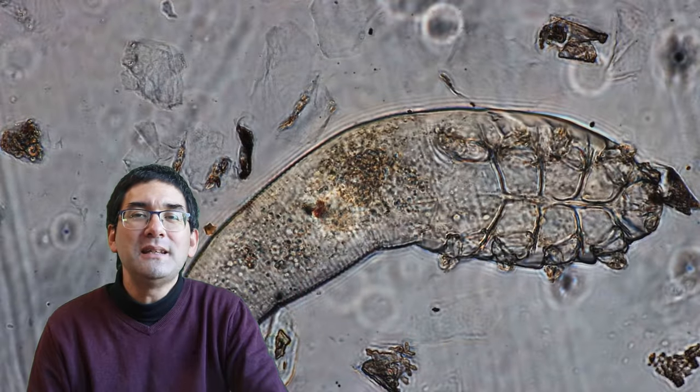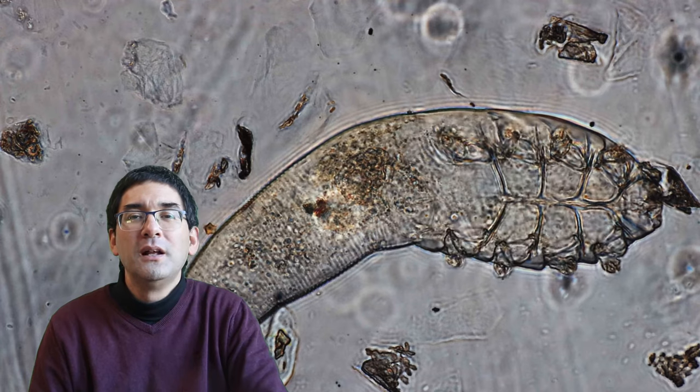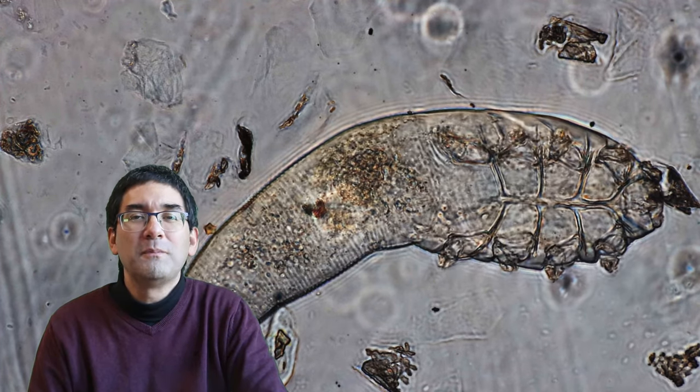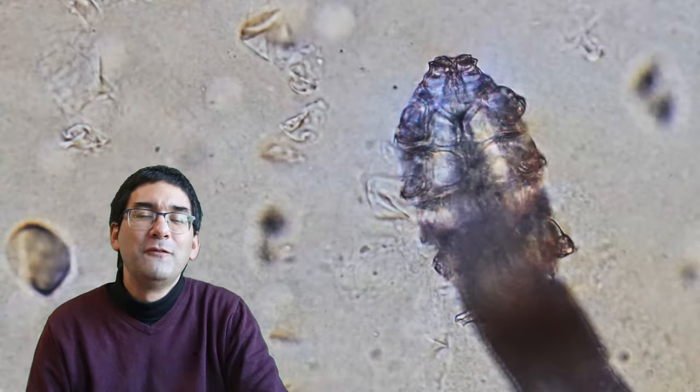The face mites can be easily collected by taking a sticky tape and placing it on your forehead for about 30 minutes or an hour, and they like to come out at night, so you have to keep it dark. The tape can then be placed on a microscope slide for observation.